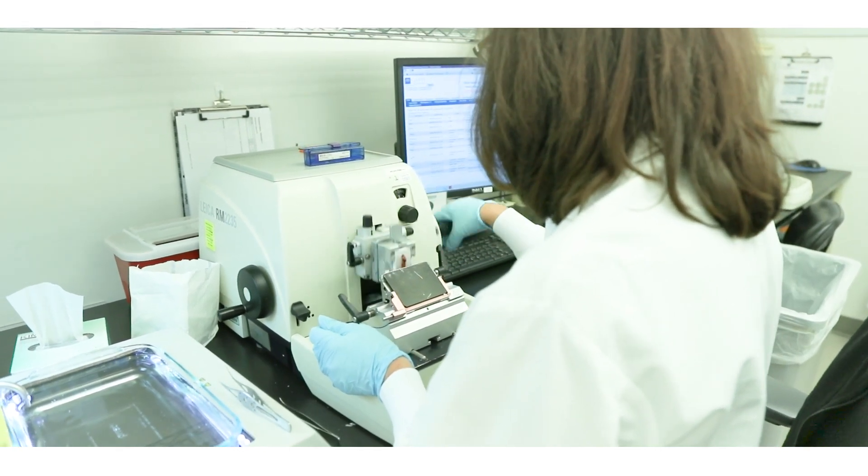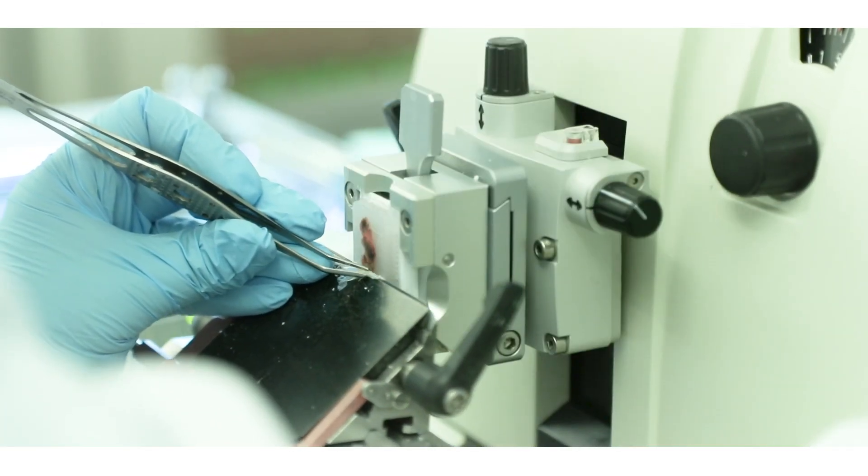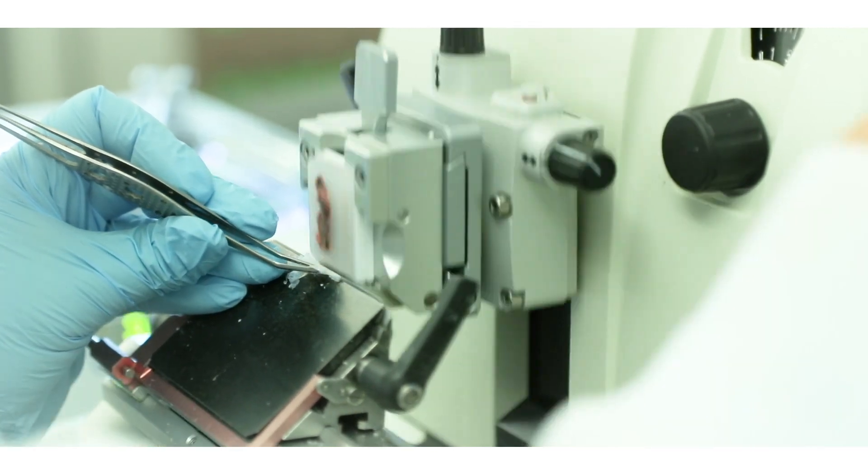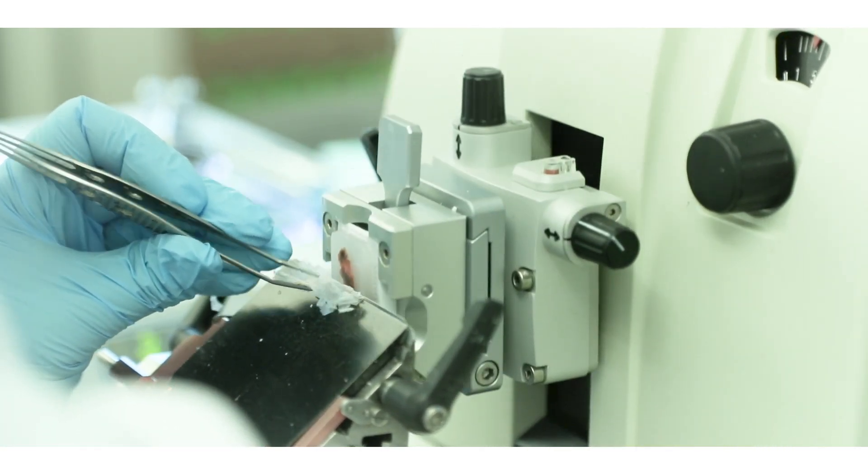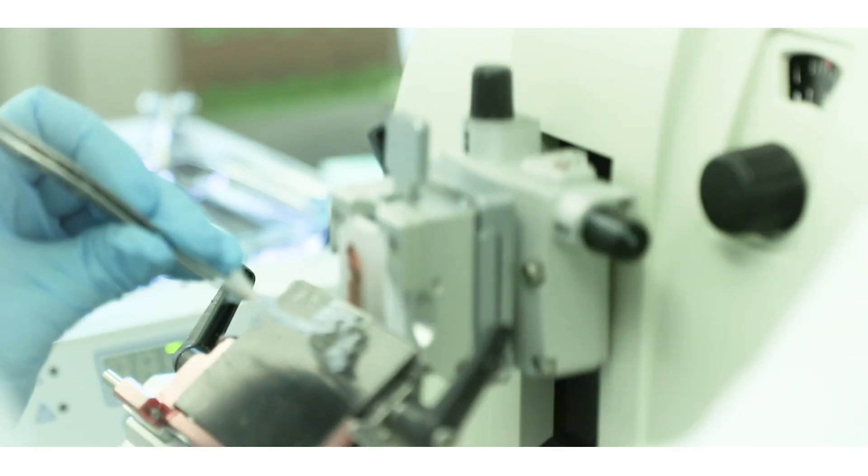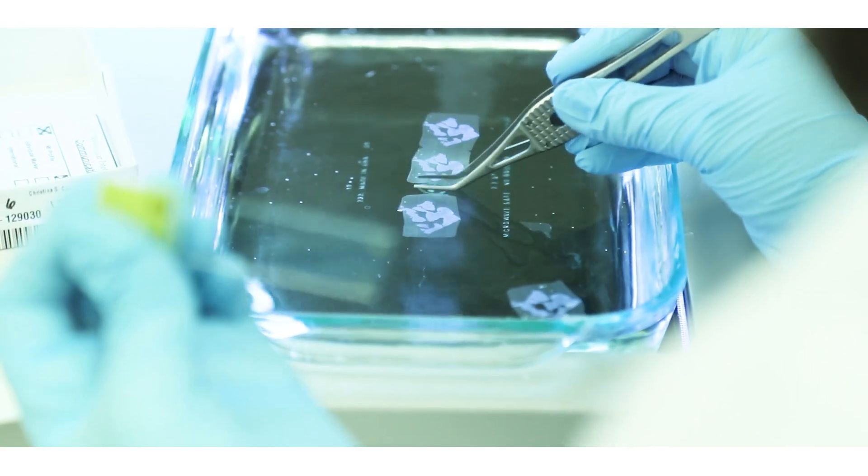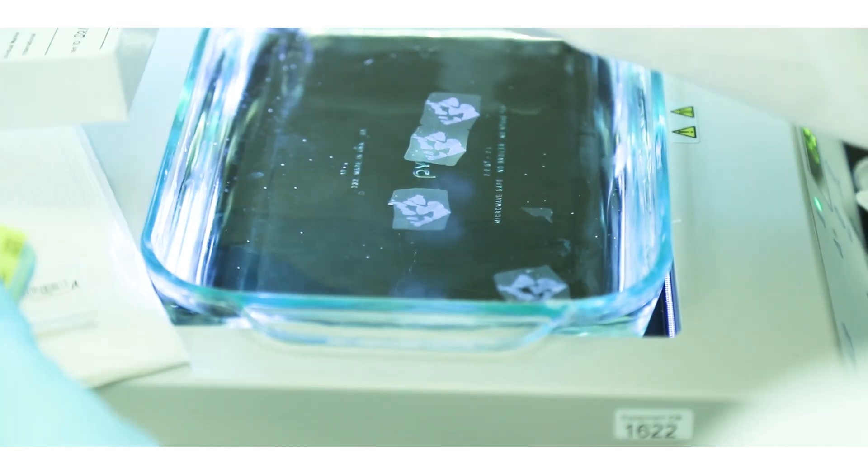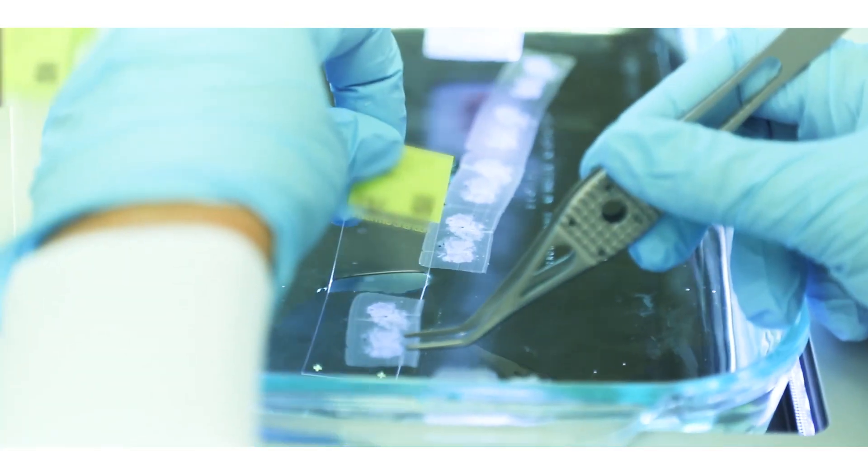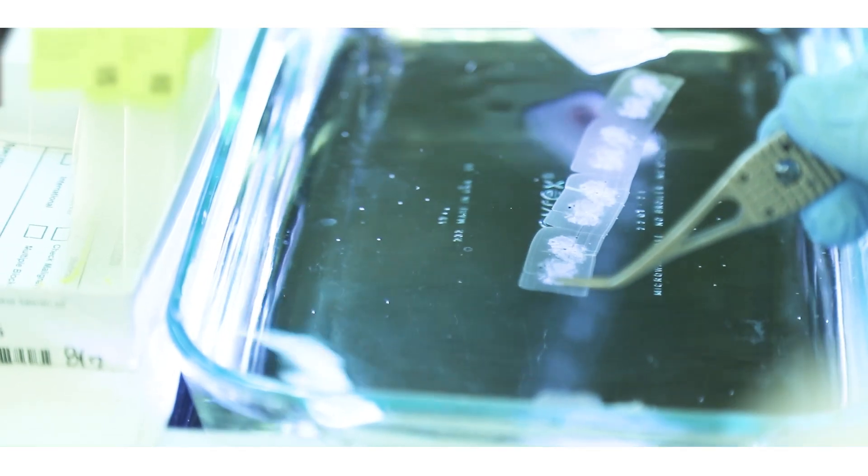The first stop within the lab is in Microtomy. So Microtomy is where you take that piece of tissue and you mount it onto a special machine called a Microtome that allows you to slice off very thin pieces of the tissue. And so we cut at a thickness that is substantially thinner than most typical people that are preparing slides like this.